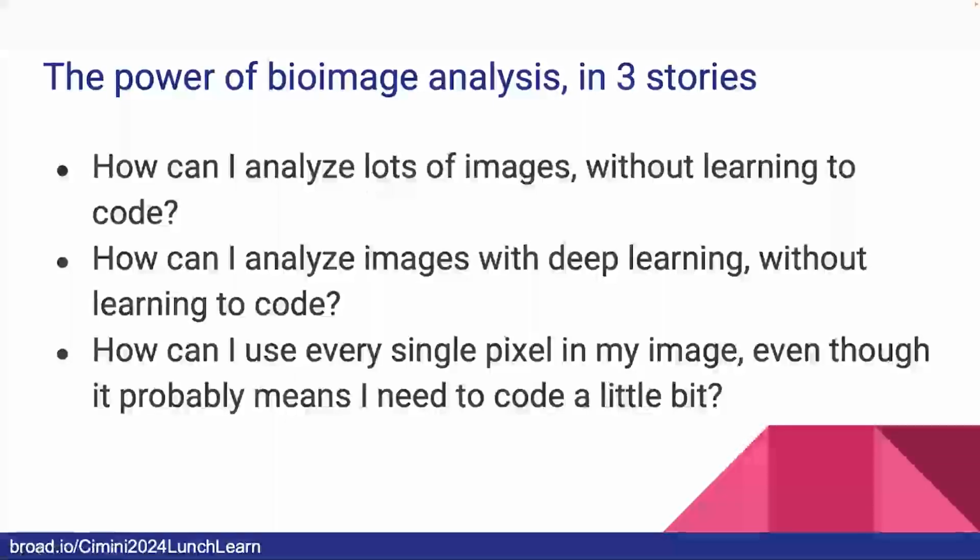There are going to be three little 10-ish minute subparts to this. How can you analyze lots of images without learning to code? How can you do that with deep learning and also not learn to code? And then, especially if you're doing things like multiplex stains, how can you use every single one of those pixels to get really high-dimensional, really powerful analyses? For that, you probably have to code a little bit. And again, nothing wrong with learning to code. If it's something that you're interested in doing, I totally recommend it. But sometimes you also have other things you're trying to learn or do. We're trying to make it so that learning to code is not a minimum requirement for doing great microscopy and therefore great image analysis.